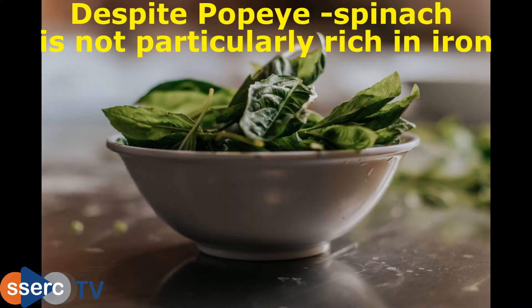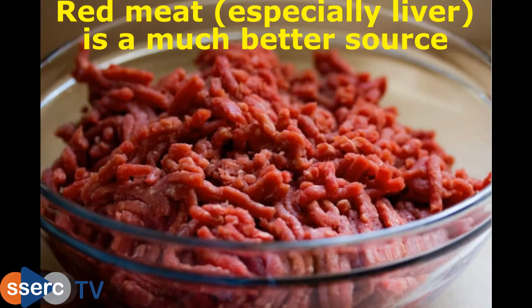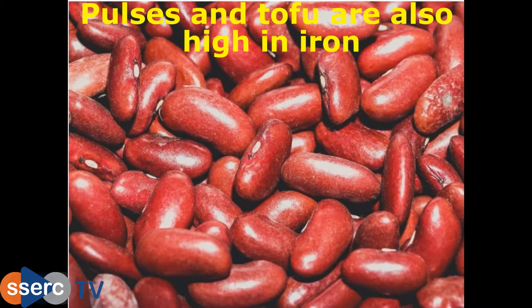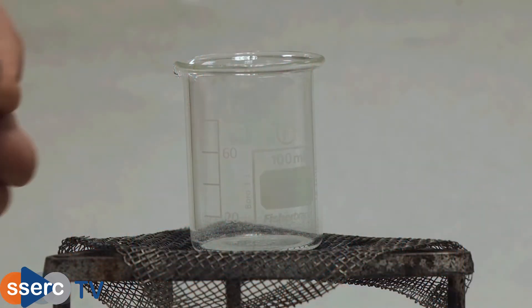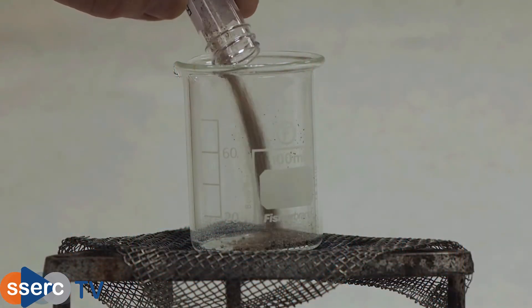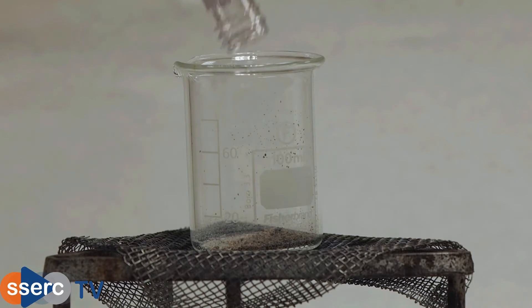It is possible to analyze the iron content of foods quite easily using colorimetry, as long as you can get the iron into solution. In this case we're using tea, but the same process will work for any food.